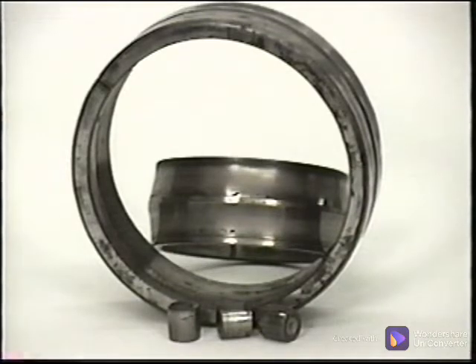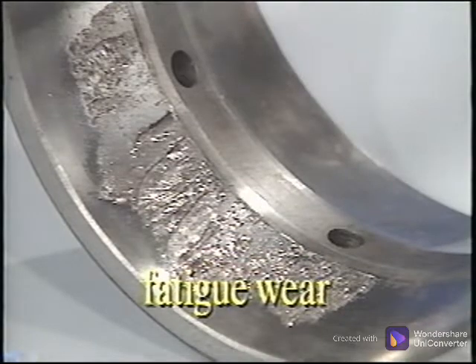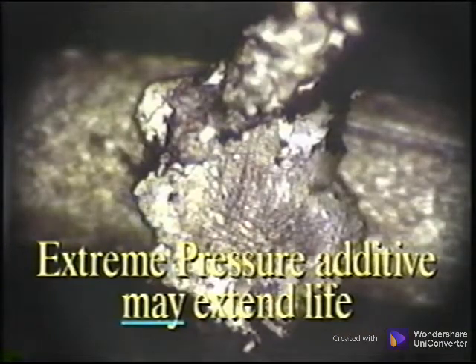Fatigue wear occurs when components have been flexed due to repeated changes in loading and they simply come apart. The root cause may be misalignment or unbalance, but the extra load placed on bearings, shafts, and other components causes separation in the metals. This is the spalling that occurs in bearings or gears, and when examined under a microscope, will be chunky in shape. This fatigue wear should alert you that the components are nearing the end of their life. An anti-wear additive, sometimes called an extreme pressure additive, can be input into the system at this point and may extend the life to a scheduled outage.